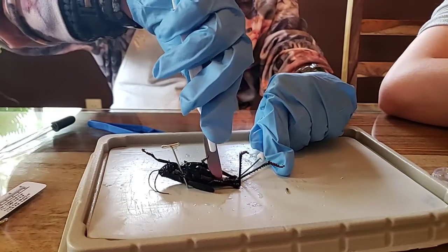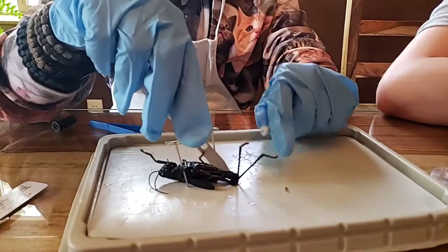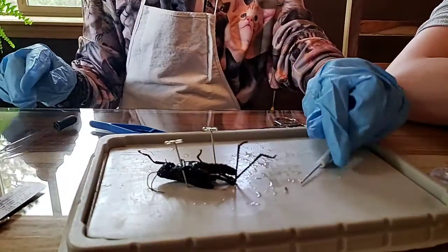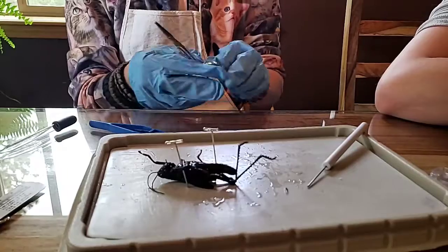These are going to be a little harder. So once you get your cut, like Tanley's doing, she's cutting in with her scissors. So that's a good way to do it, Lanston. So get a cut, and then go at it with your scissors.